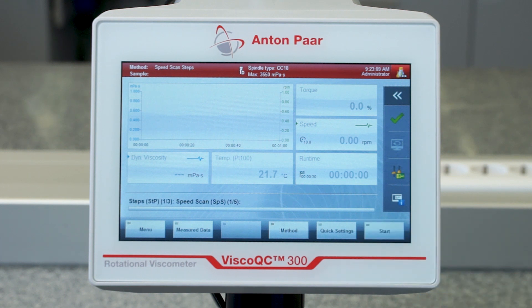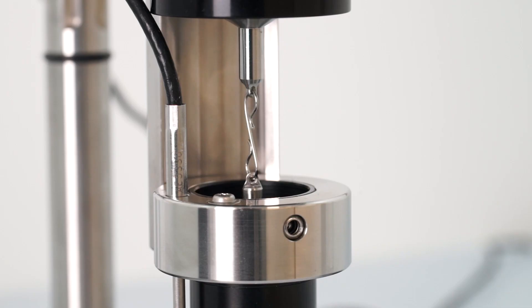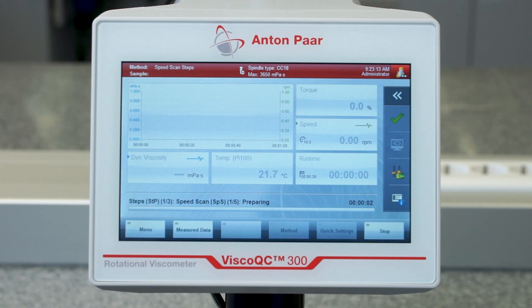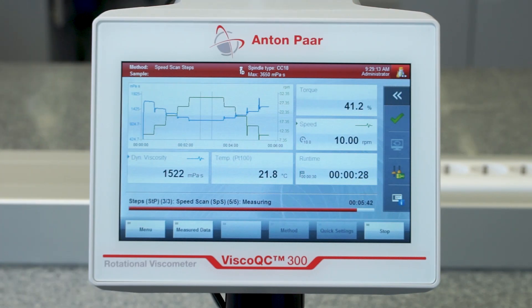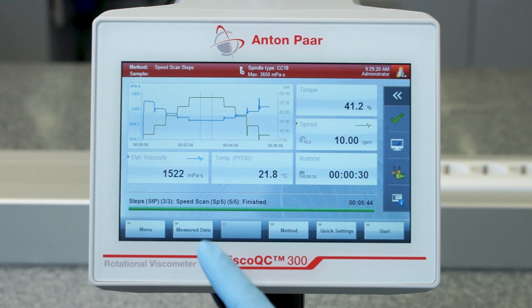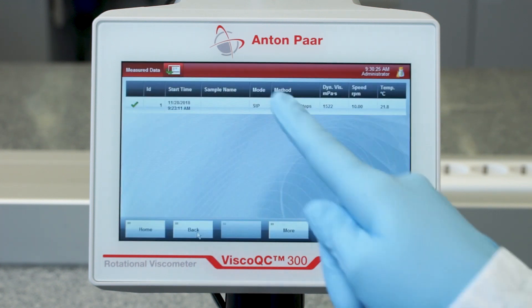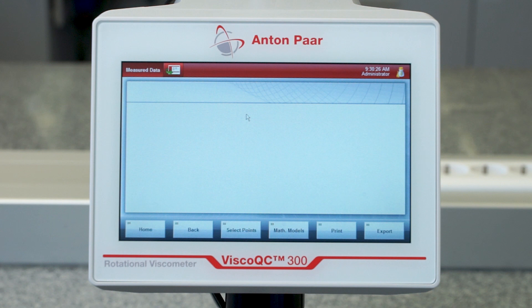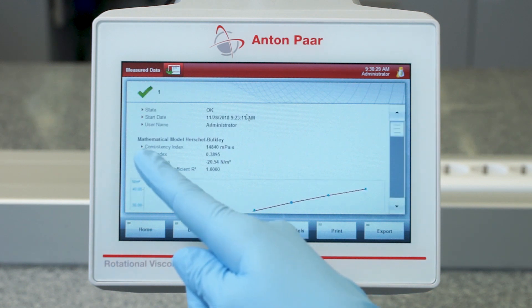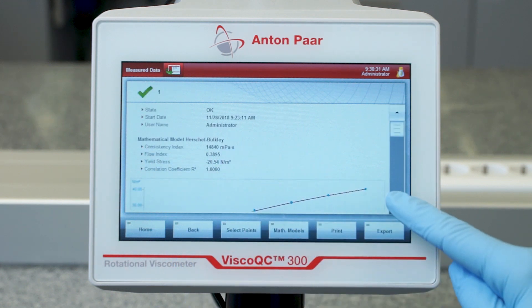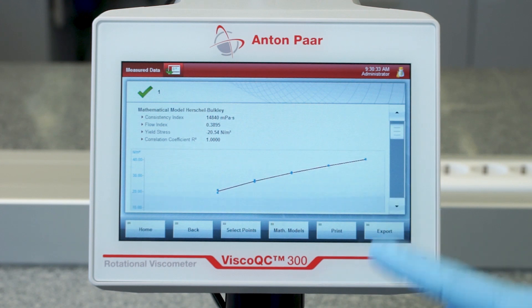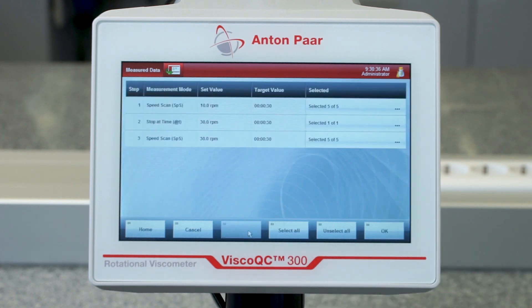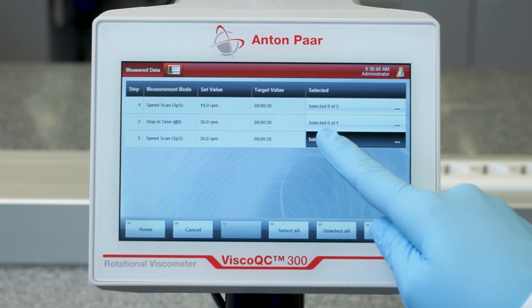Tap Start to begin with your step program. As soon as your measurement is finished, all data can be found in the data memory. In this case, as a vane spindle is used for measurement, the yield point according to Herschel-Bulkley has been determined. You can even select only a certain step or certain points and perform the measurement data analysis afterwards.